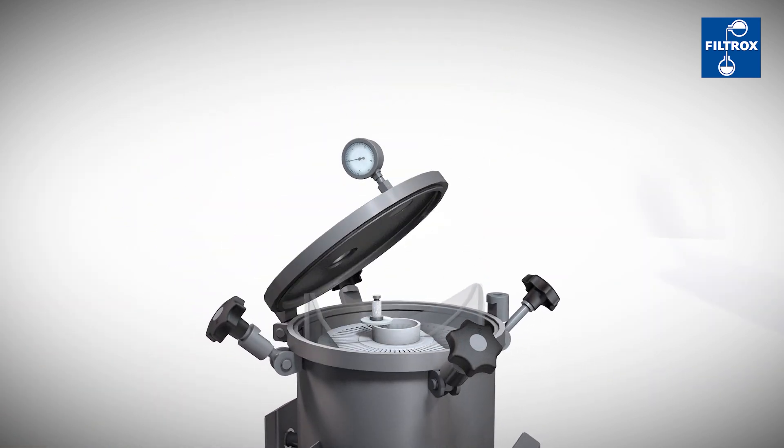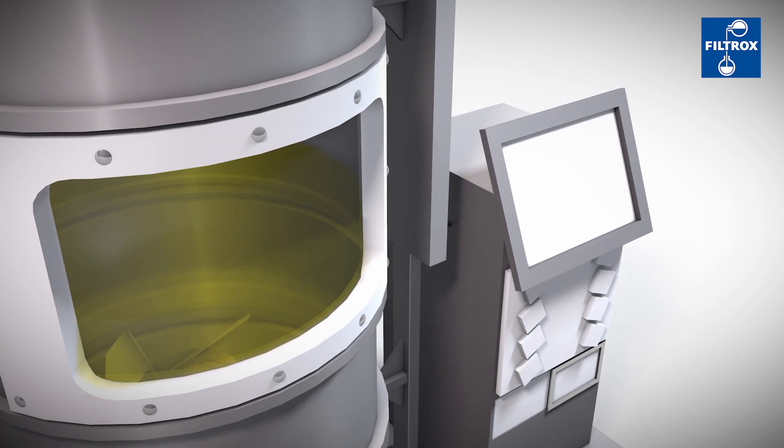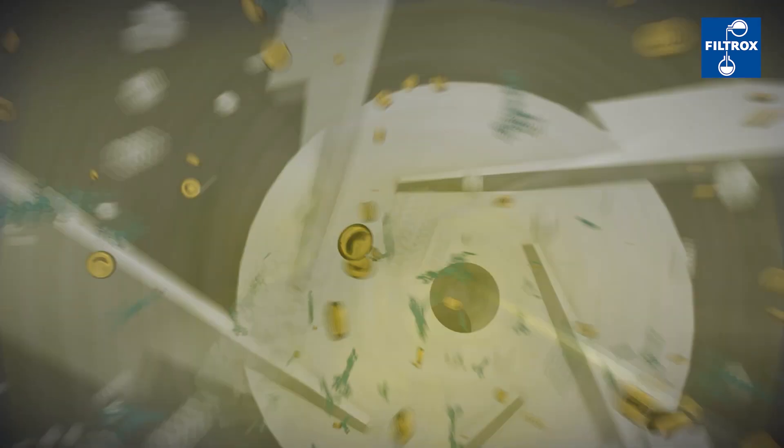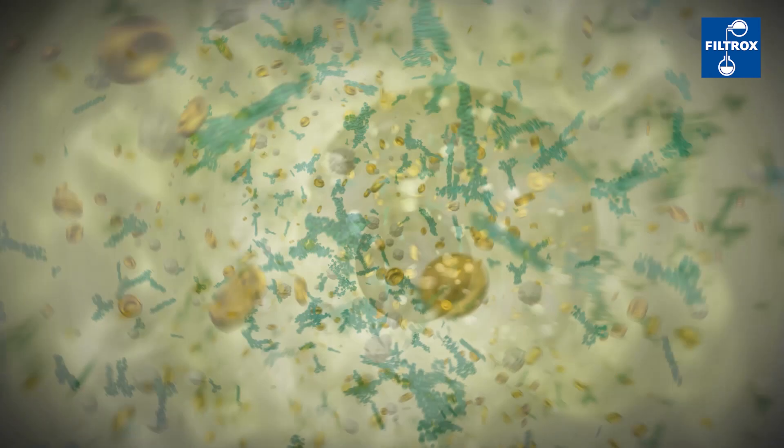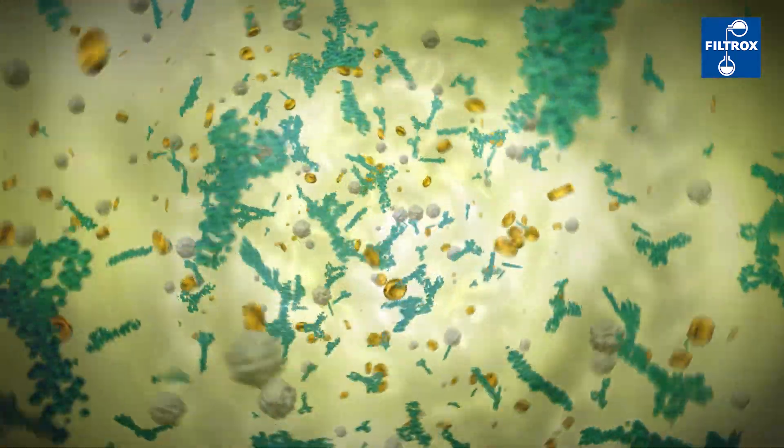The PuriDisc SU module is inserted into the Diskstar SU support housing and connected to the system. The fermentation broth/DE mix is now pumped into the PuriDisc SU filter module through the inlet at the bottom.